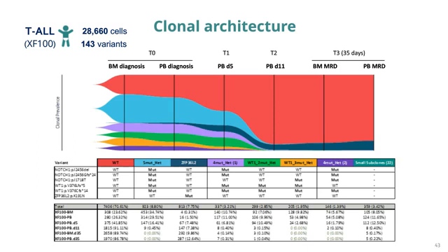And then other cells diverge and acquire this mutation in the zinc finger protein that somehow is giving these leukemic cells an advantage during the treatment, and they are not responding. So as I said, the good thing is that Tapestri allows us to detect this clone early on. This is an example of leukemia evolution during the treatment, but over a short time.